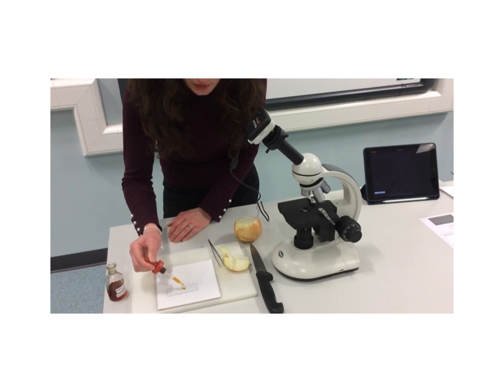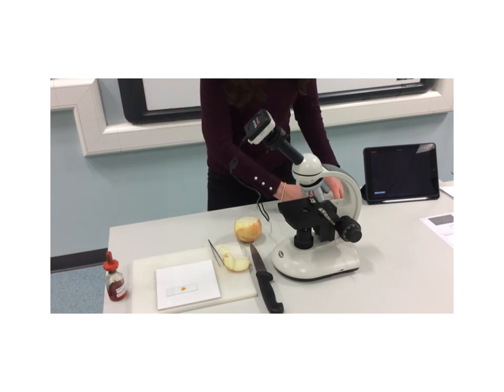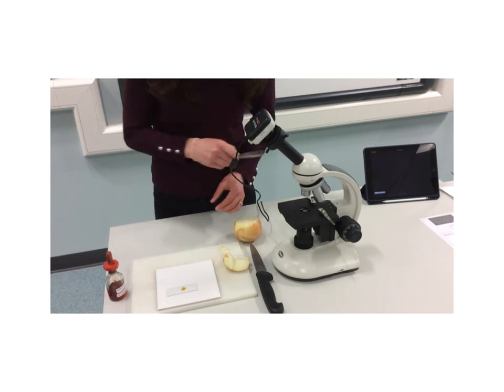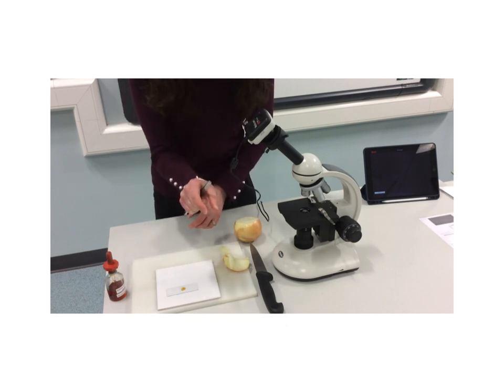So I'm just going to put 1 or 2 drops on, and then I don't want to just put this under my microscope now, because the lens wouldn't be protected from it. If I was to put this straight under, the lens might get iodine on it, which could then stain the lens. So what I want to put on it is this little cover slip.